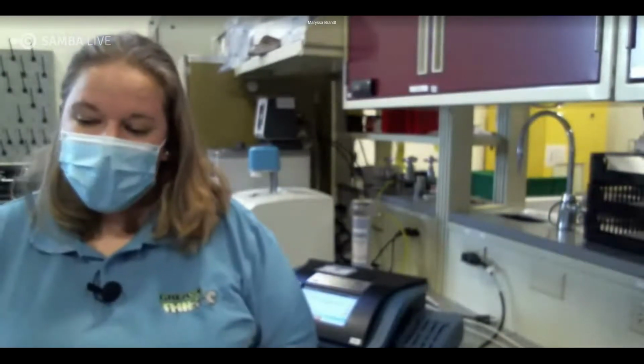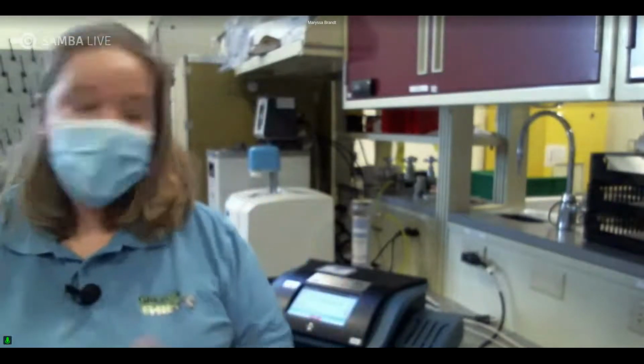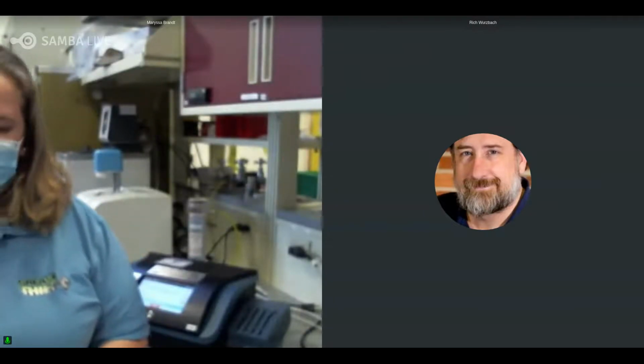Right. But again, the purge at the beginning does a 30-second purge, which is meant to take away all that ambient moisture. So it doesn't start testing as soon as you put it in. As I showed with calibration with the other sample, it does take about 30 seconds or so to purge to get out all that ambient air. So it's not affecting the sample. Now, I would not recommend putting a completely wet vial in there. It is supposed to be dried and clean, and that's per the manual instructions. But if you are still worried about that, you can just test an empty vial.